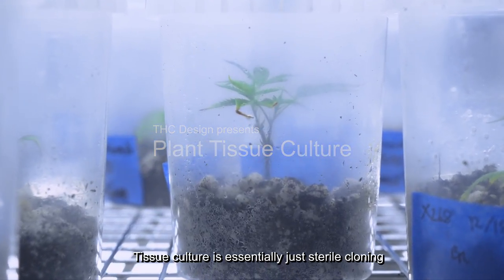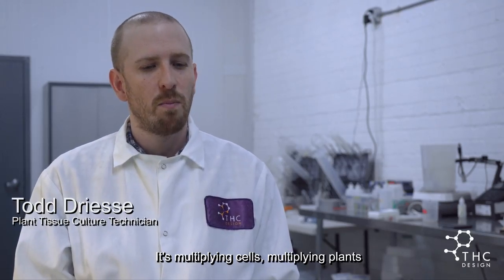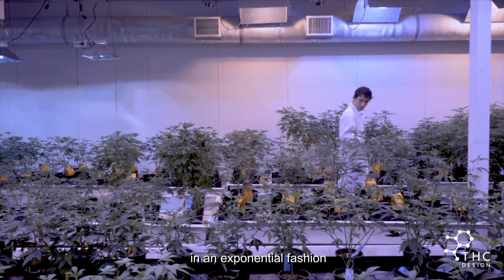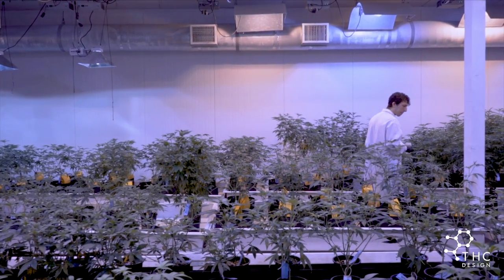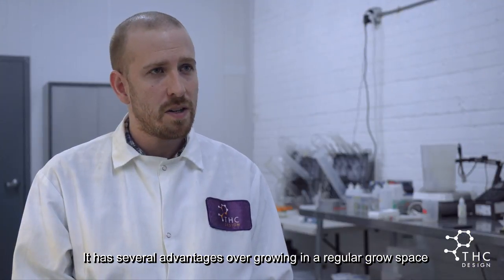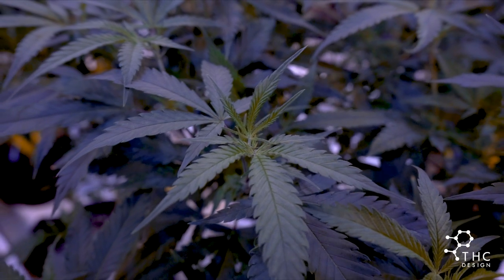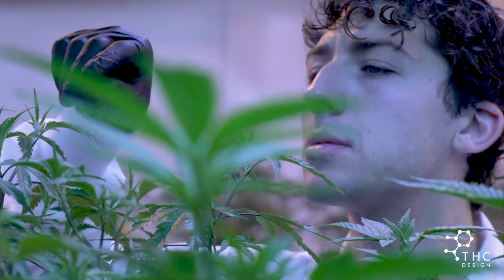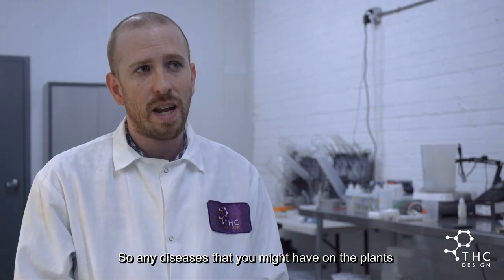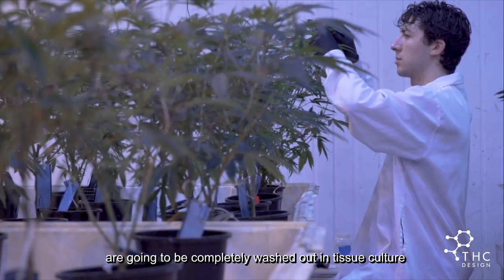Tissue culture is essentially just sterile cloning, just to put it in growers' terms. It's multiplying cells, multiplying plants in an exponential fashion. It has several advantages over growing in a regular grow space. One of them is that you're not using as big of a space. Other advantages are that it's completely sterile, so any diseases that you might have on the plant are going to be completely washed out of tissue culture.